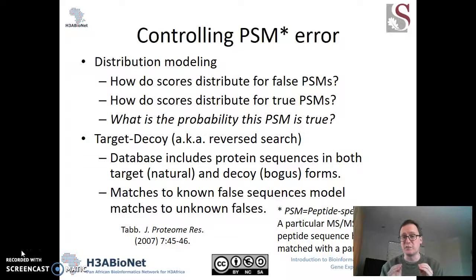There's also another approach called the target decoy approach that sorts all of the spectra from the best score to the worst, and for every place where you might place a threshold against that list, you ask, what is the false discovery rate for the general pool of identifications that pass under these circumstances? So that's a much broader technique that is only intended to estimate the error rate for the whole collection of passed PSMs.